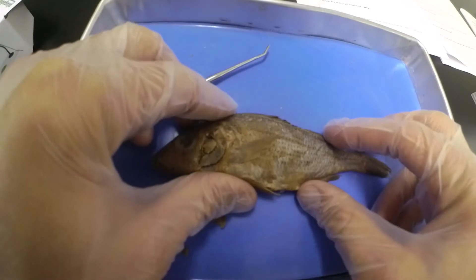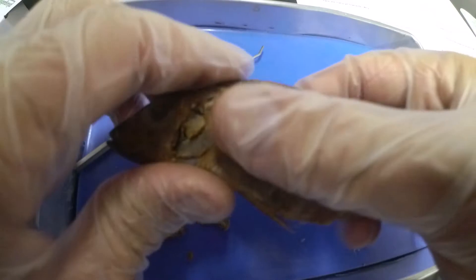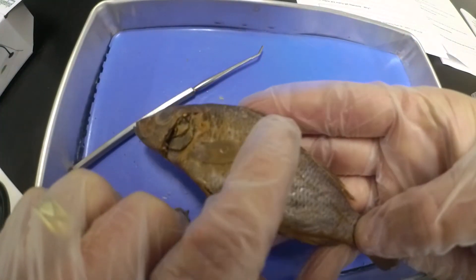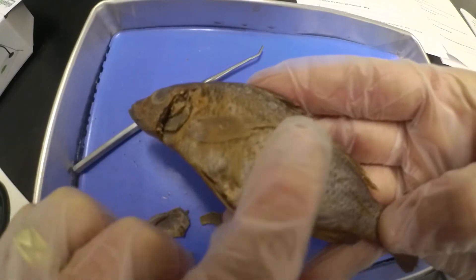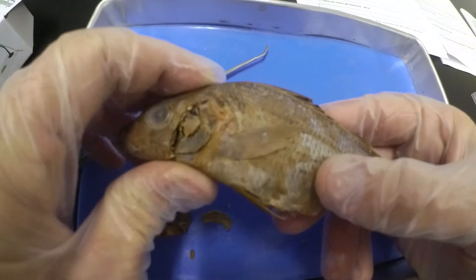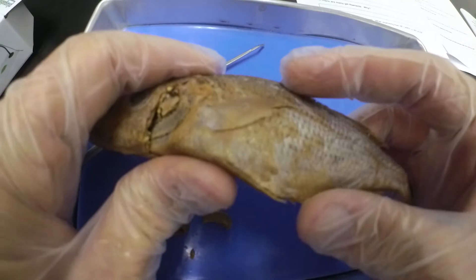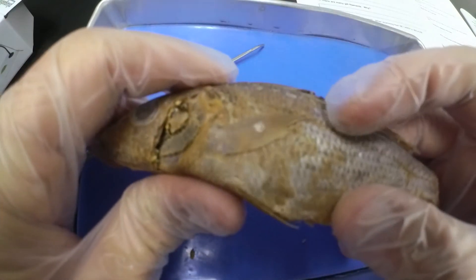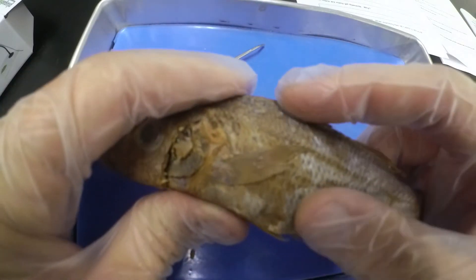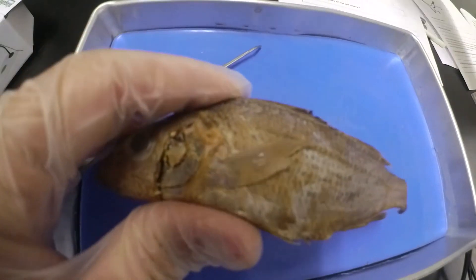Next we're looking at the scales. The scales have a very smooth feel if we come from the front — rub fingers from the front, it's very smooth. If I come from the back, it's much rougher, more like sandpaper. So smooth from the front, rough from the back — again, that fits in with the protection aspect we looked at earlier. If we look at them under a magnifying glass, you would see a circular rectangle with rounded off corners.